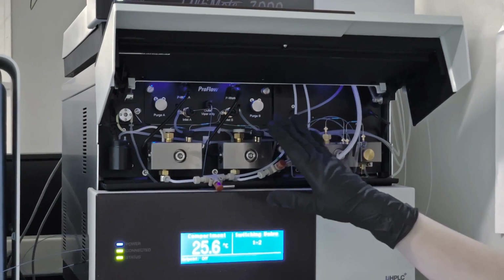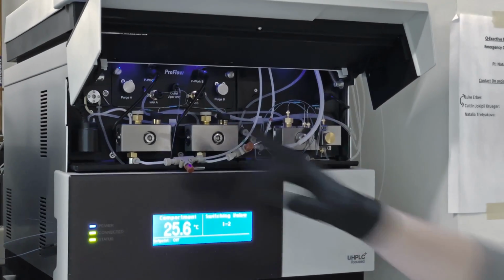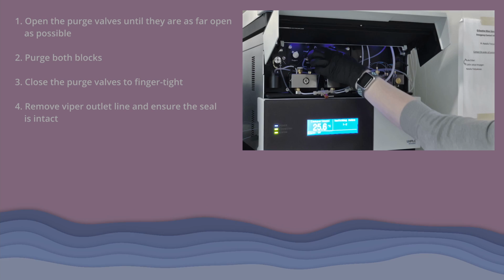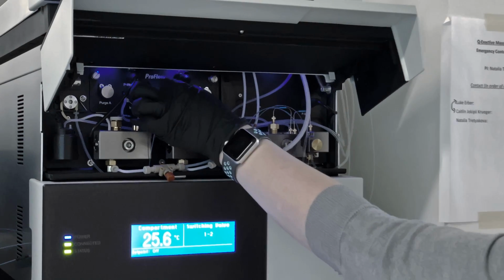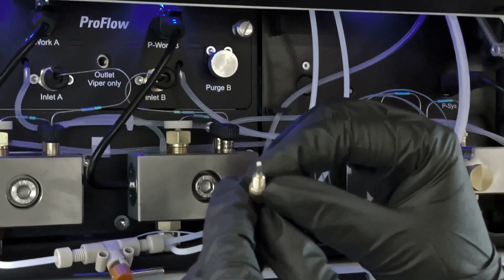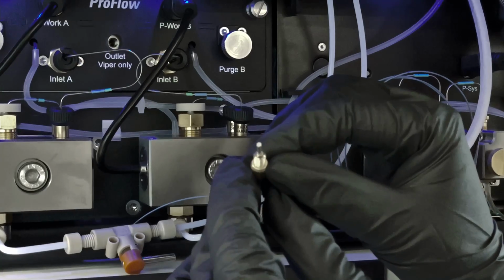So with the purge valves closed, you'll then want to remove the pump outlet Viper line. And these nano Viper lines are extremely fragile, so be very careful while doing this. You'll notice the line has a tan seal at the end of it. If you pull out the line and notice that that seal is missing, please contact someone who's in charge of the instrument.